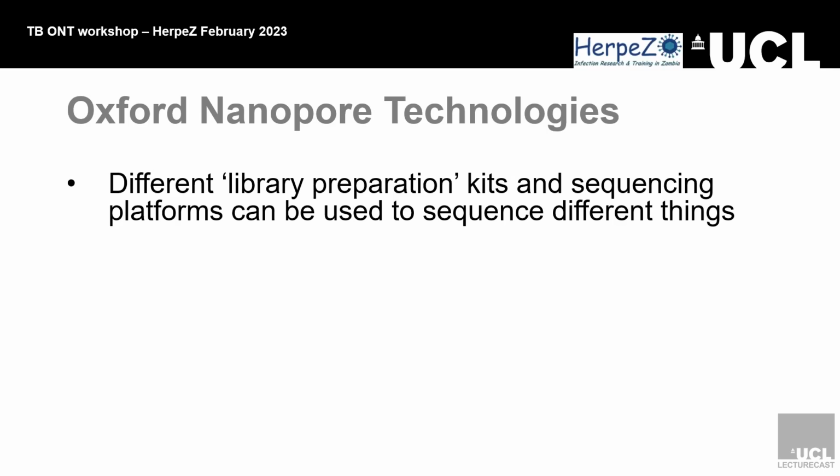You would have already either amplified it or, as we're going to do now, we did a culture and then we extracted the DNA from the culture. So the DNA that we got from the culture is what's sequenced. We're not using an enzyme to add sequence to it.